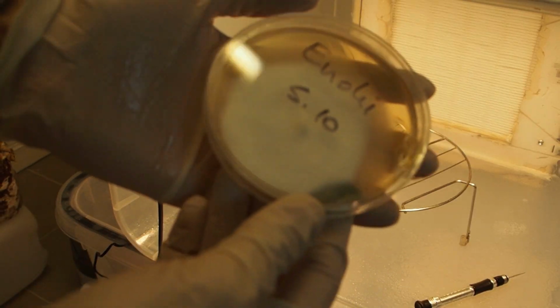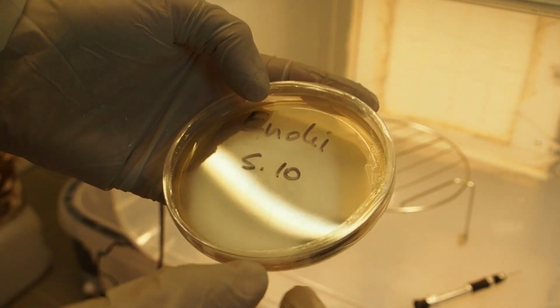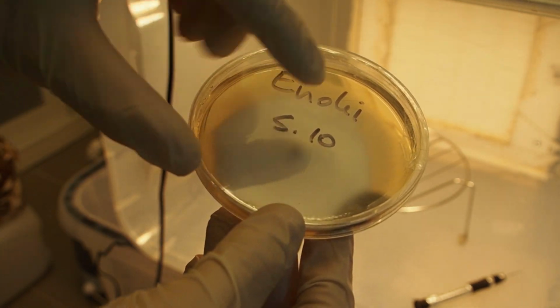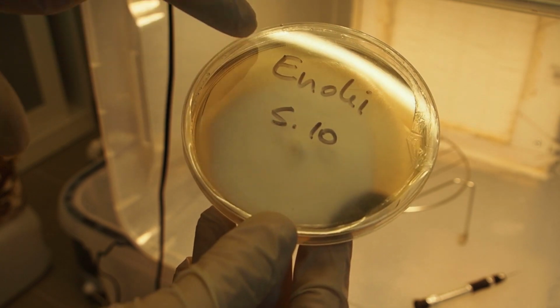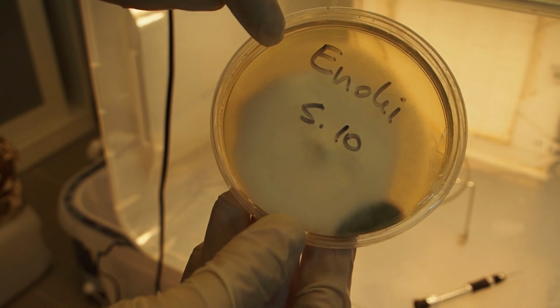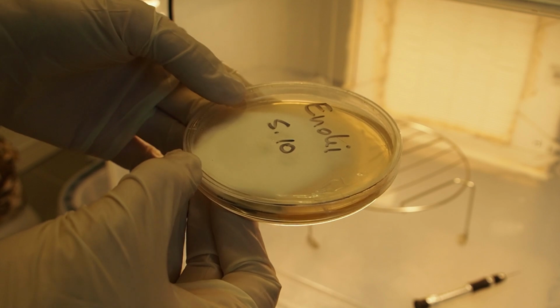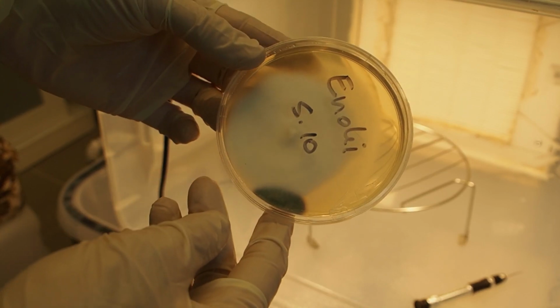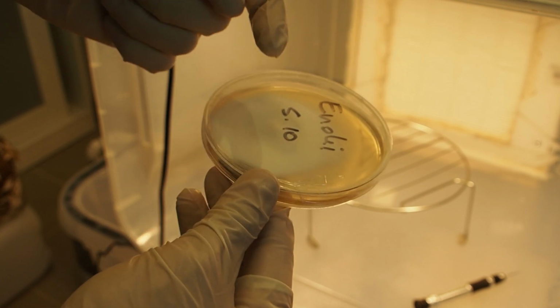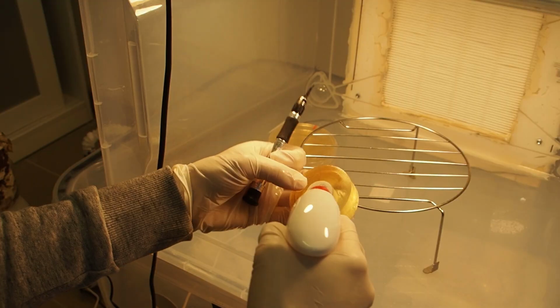Now the enoki mushroom also got contaminated with a green mold that came a little bit later. But the enoki mushroom has grown really wide, so now I will try to open this up and cut out some mycelium, which is the farthest away from the green mold. And also I'm going to put it into my laminar flow hood like this, so that the spores of the green mold are flying towards me and not onto the white mycelium.